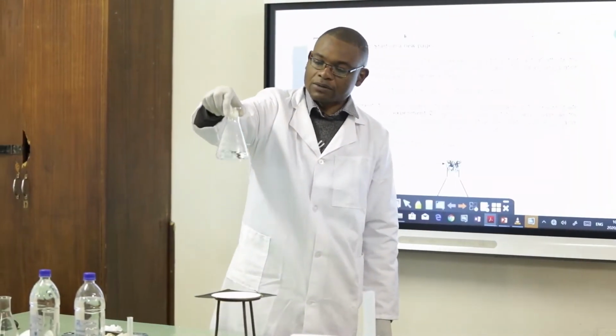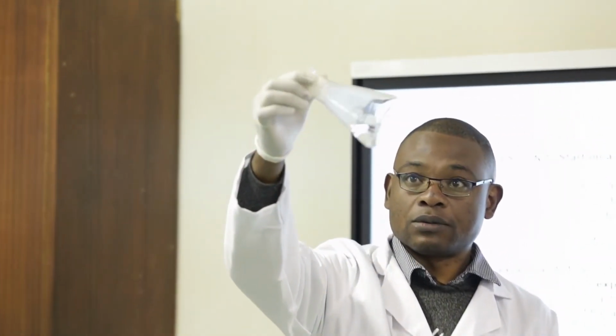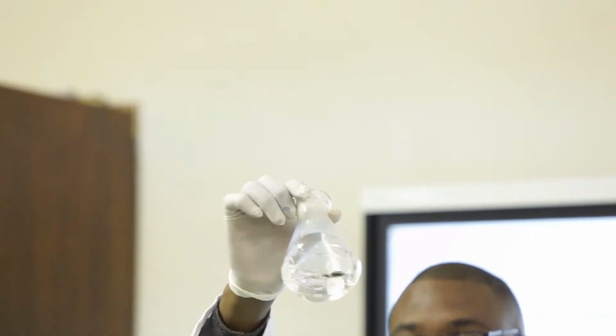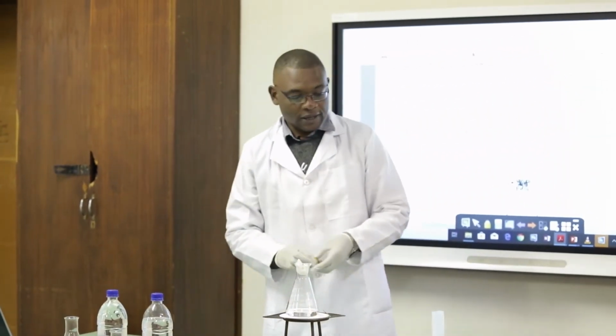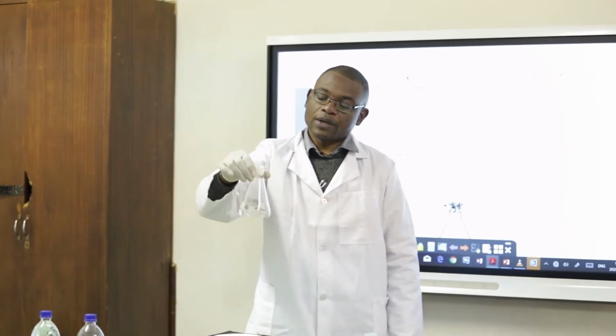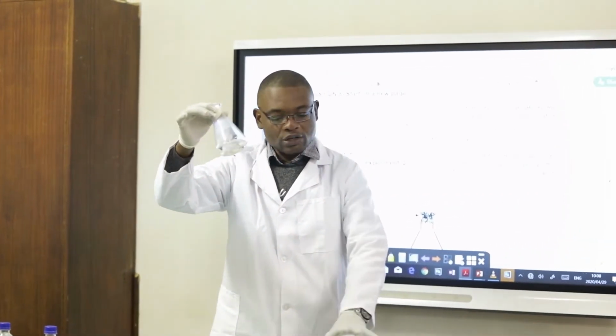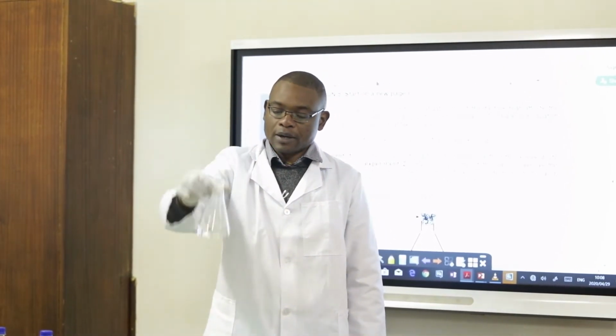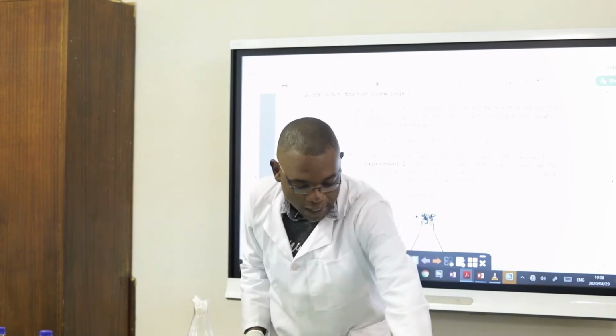So, boys and girls, look at our magnesium. It's gone. It's no longer there. And if you check how long it took for the magnesium ribbon to react, it took less than a few seconds. Okay. So that was a ribbon. So I'm going to throw away this and put a new solution, and then I will use magnesium powder.